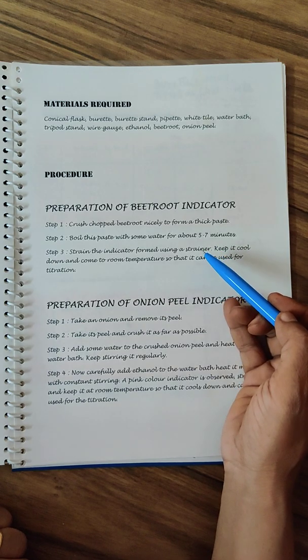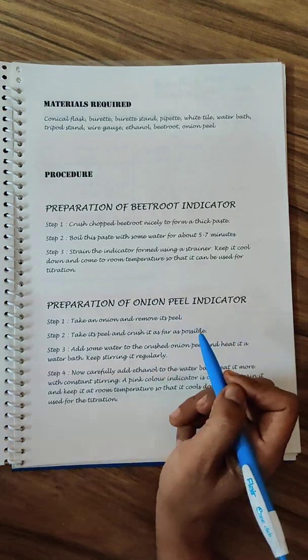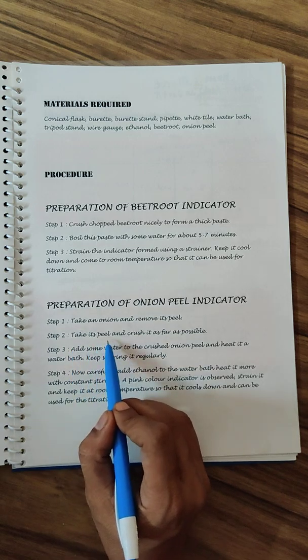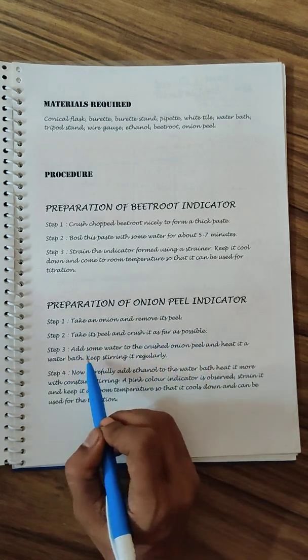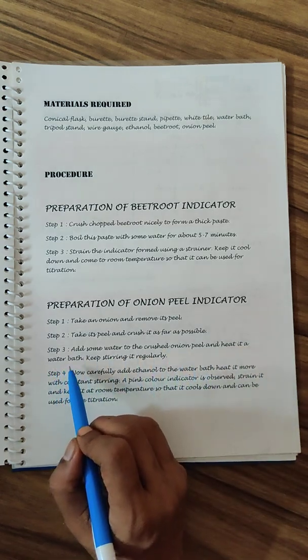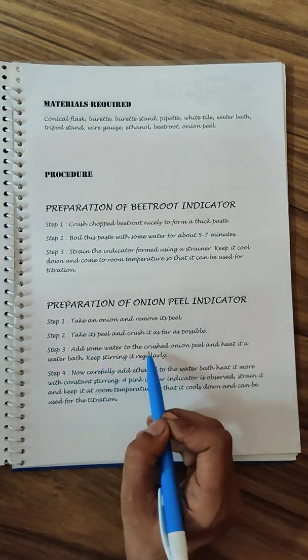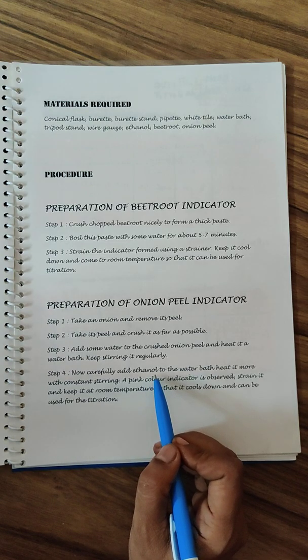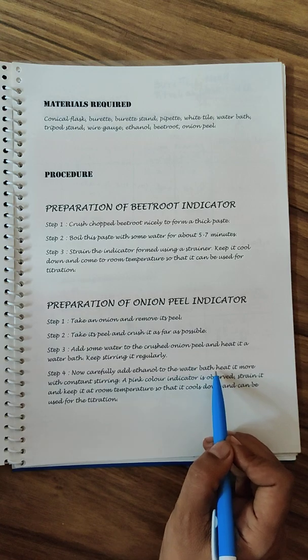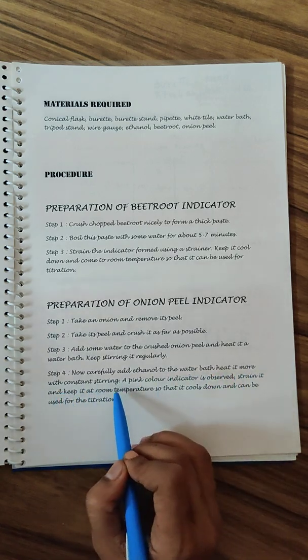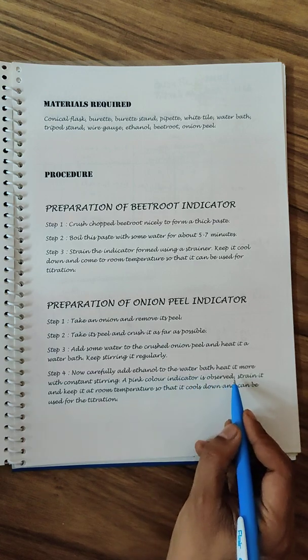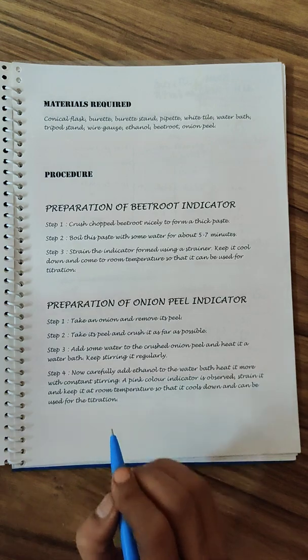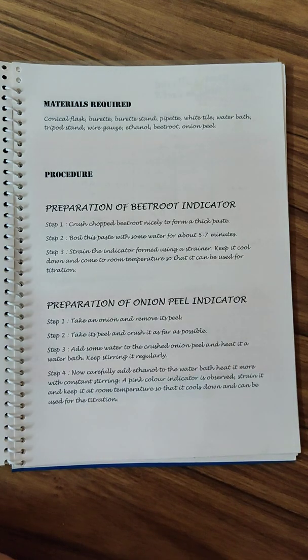Similarly for the onion peels which is acting as an indicator, you will take onion and remove its peels. Take the peels, crush them as far as possible, then add some water to the crushed peels. Heat it in a water bath and keep stirring. At this point you need to add ethanol because onion peel's colored component is not fully soluble in water. Heat it more on the water bath with constant stirring - a pink color indicator is observed.